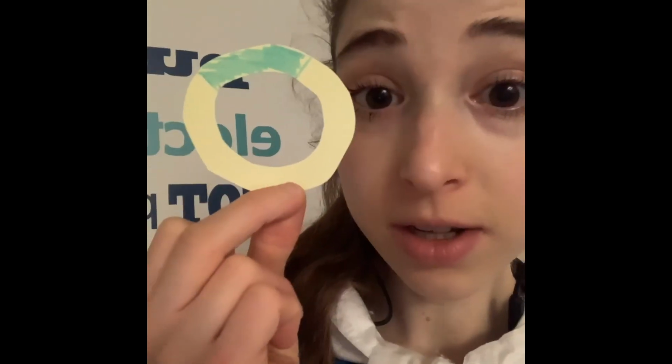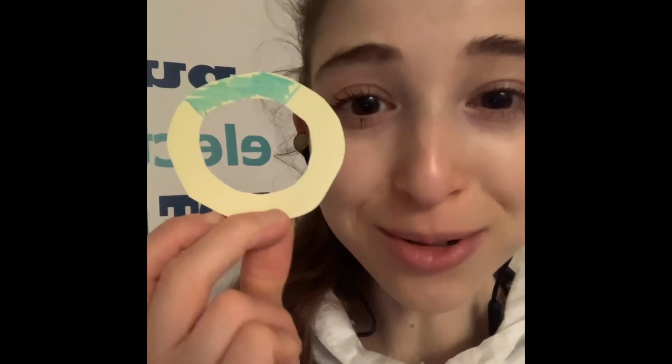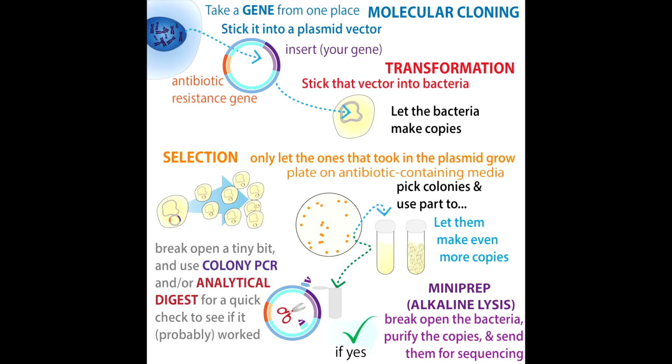Do I spy a post about molecular cloning? Why, indeed, I do. Molecular cloning is one of the most important techniques that you'll use in biochemistry, so let's take a look. It's not about making copies of your dog or anything.